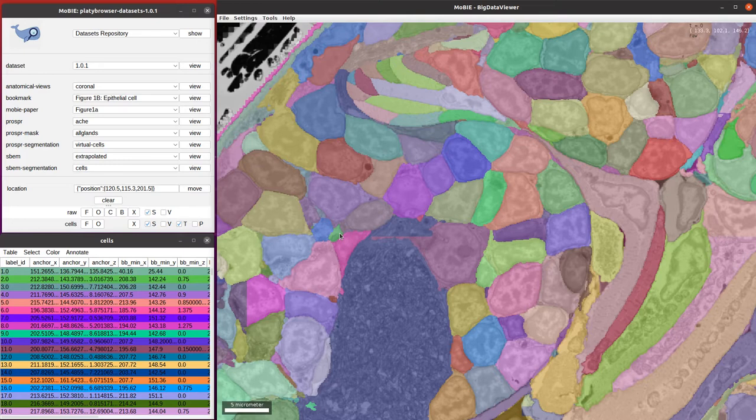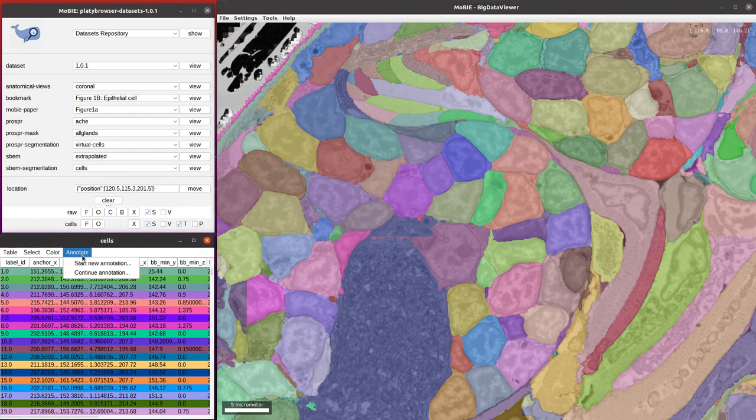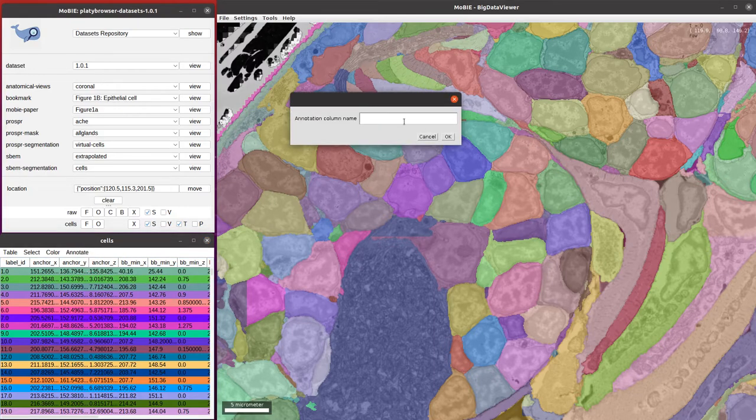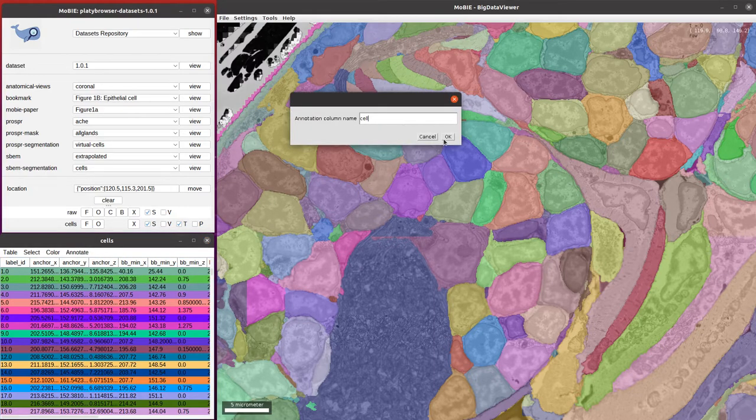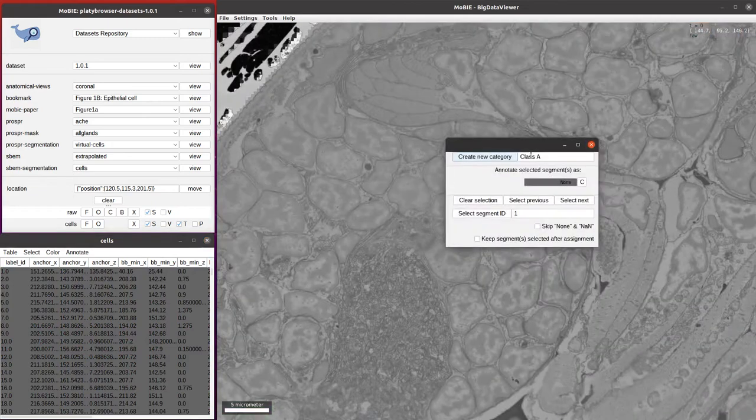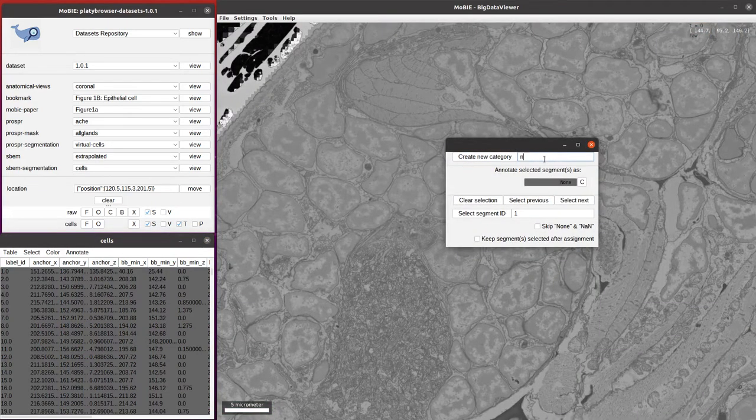In our case, what we would do is we would go back to the table, click annotate, start new annotation, and then give a name for the column that's going to hold our annotations. We'll just call it cell. That'll then open this window to make our categories.